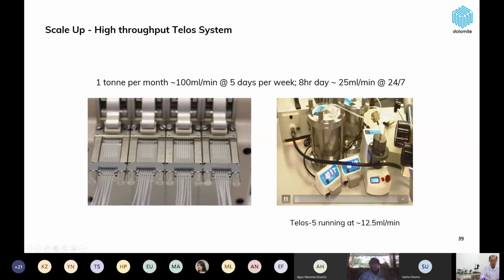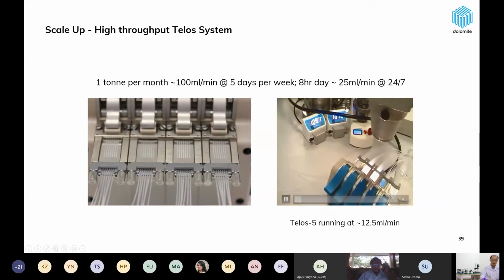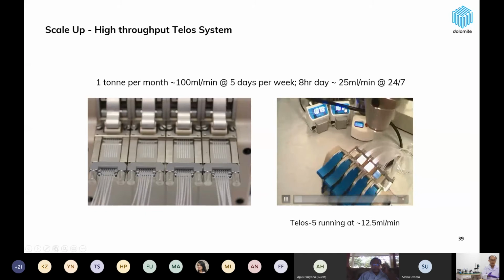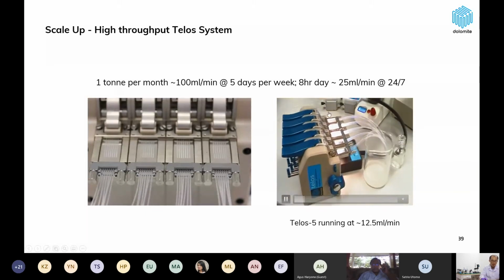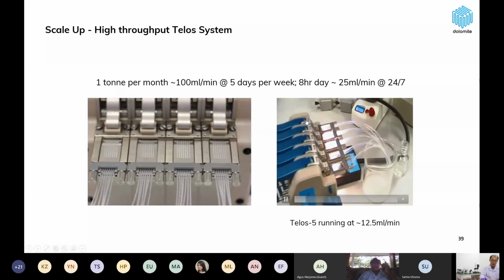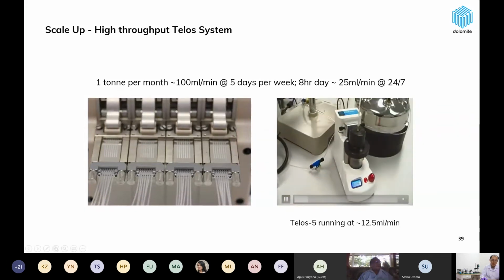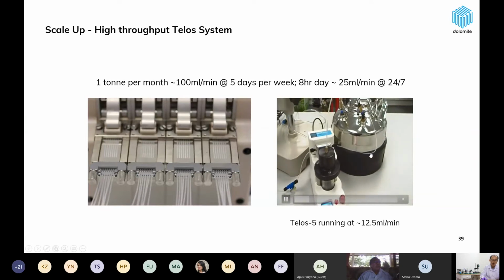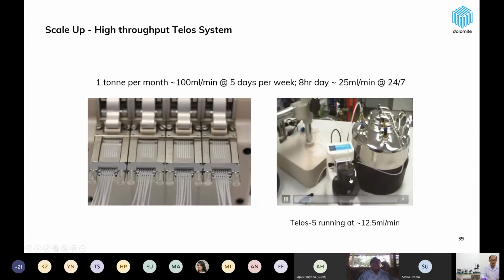And here is a pump and an extend device, the chamber, to increase the reagent content. And here is the 5 input chip working together in parallel by some Telos modulars. And the other pump is a custom part. We can also increase the volume of the reagent that can be used in this case.